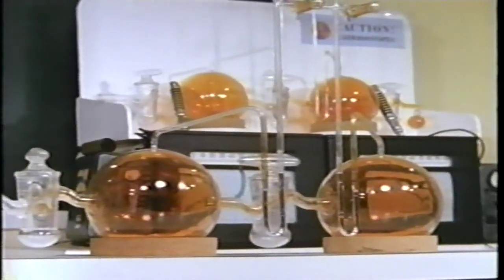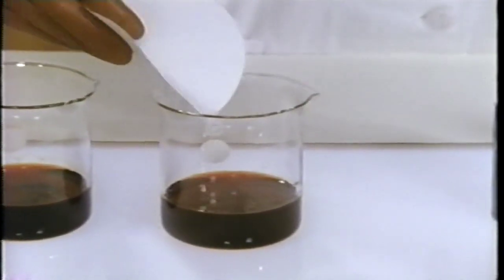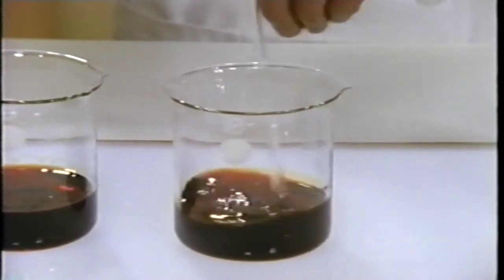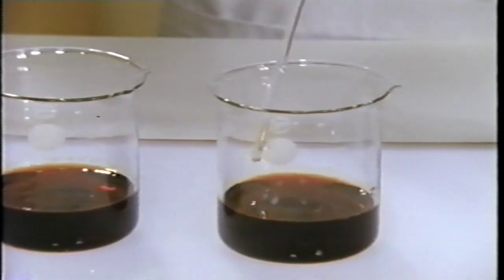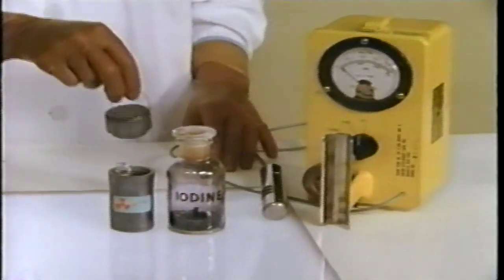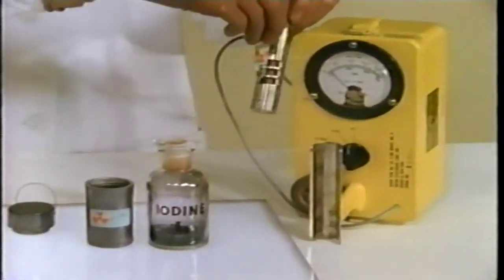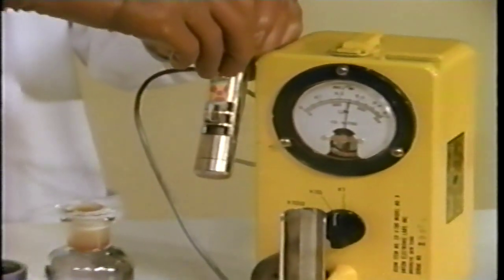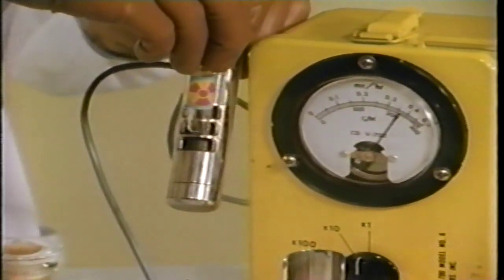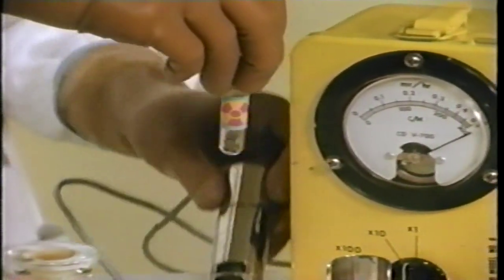But what about solubility equilibrium? Is it the same? Let's add some solid iodine to our original saturated iodine solution. The color doesn't change. Now let's add some radioactive iodine. Radioactive iodine is like ordinary iodine, except that now and then one of the iodine nuclei disintegrates and changes into another kind of nucleus. We can spare a few, since we have about 10^23 of them present in the sample.